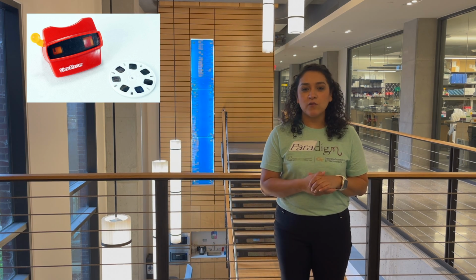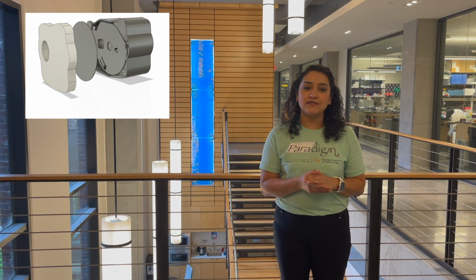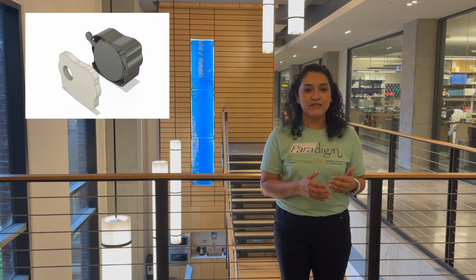To address the need for innovation in this space, we developed the ParaViewer. The ParaViewer was inspired by the ViewMaster toy that clicks through different images. Our design, however, utilizes the rotation mechanism to display a number of samples that are plated onto a circular slide adapted with cell imaging chambers.